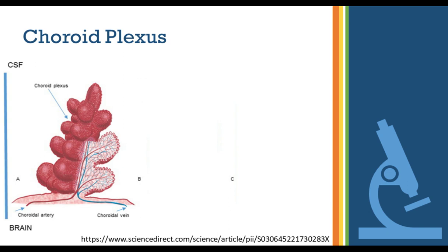So we controlled for contamination by, one, having as sterile an environment as possible, wearing the proper PPE, and extracting the choroid plexus first before doing other parts of the necropsy for collection of tissue. We processed it in a sterile hood and made sure we sterilized it every time we used it. And if it seemed like it was getting contaminated, we added additional antibacterials or antimycotics like Primocin and Fungizone if we really needed to supplement the media to make sure contaminants didn't grow. So that's a great question.